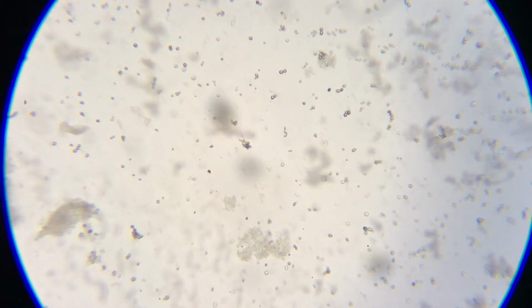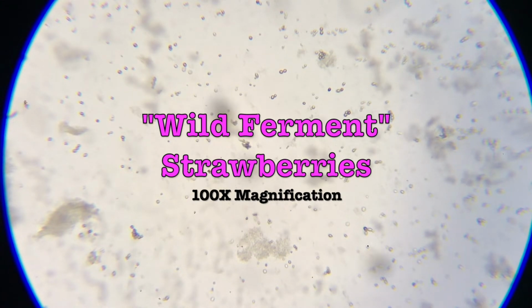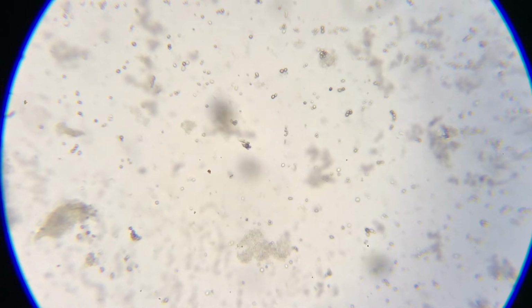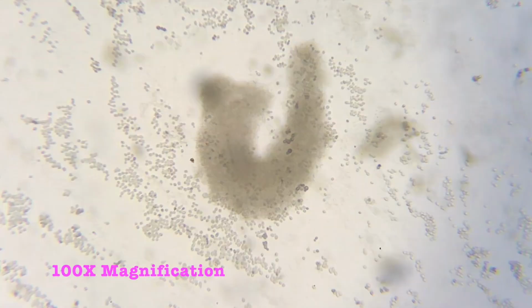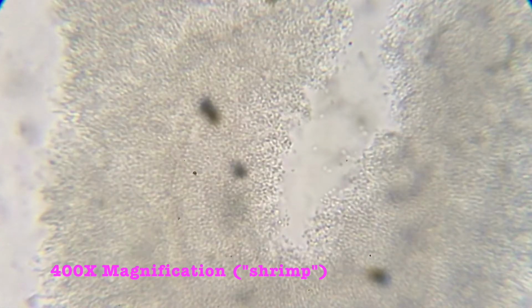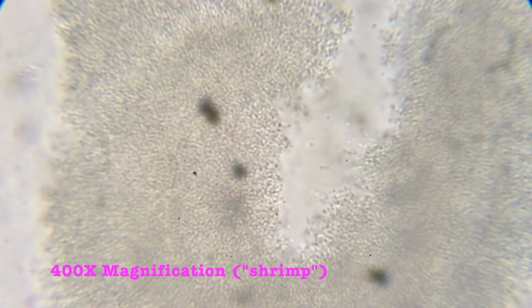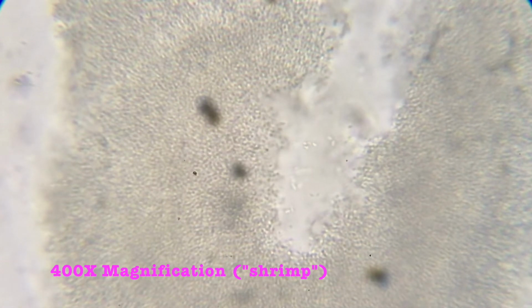Here we have the strawberries that were allowed to wild ferment at 100 times magnification. Wow, there's just so much going on. Let's look closer at this shrimp here. Okay, so the shrimp appears to be a colony of bacteria, would be my guess, because there's so little. We're at 400 times magnification.